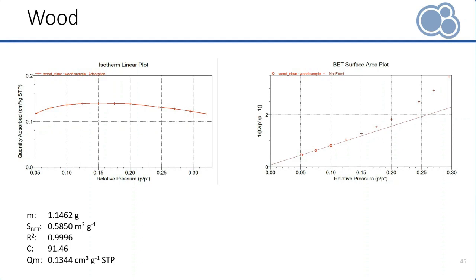There are different reasons that can lead to such a negative trend in the isotherm. A leak or insufficient degassing are 2 examples. A change in analysis temperature leading to a change of free space, or error in the free space measurements itself, can also cause such an effect. Another reason might be insufficient equilibration. In this case, using a different instrument was the solution for our problem.